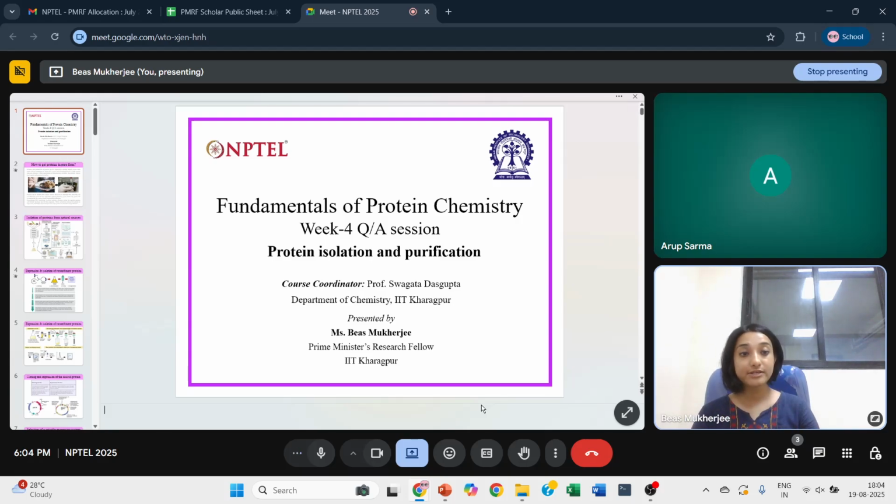So I'll give you a brief overview first. Today we are going to talk about protein expression, protein purification, and a lot of different techniques that are used in protein expression and purification in the laboratory. For example, affinity chromatography, size exclusion chromatography, and different other techniques.